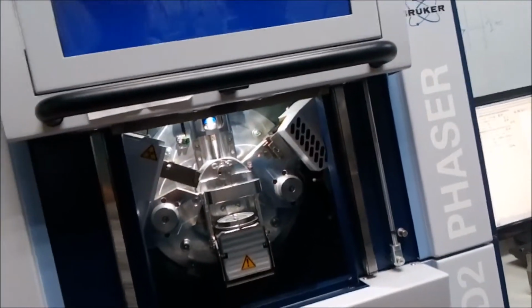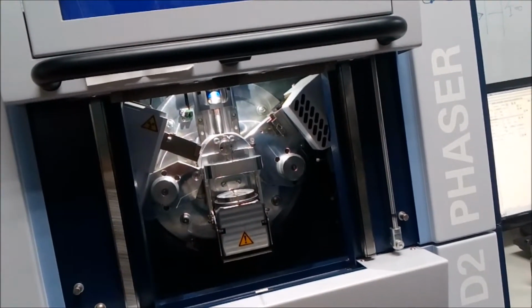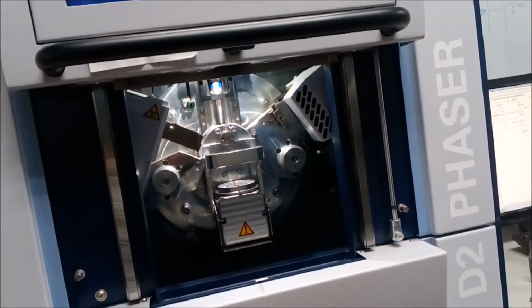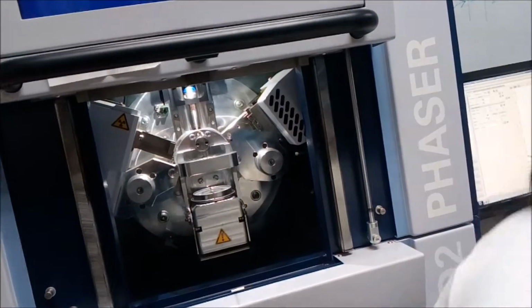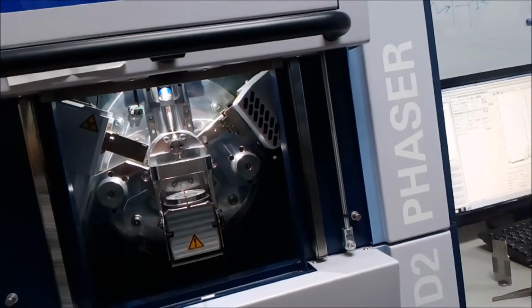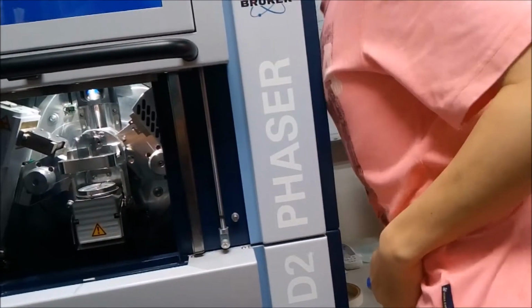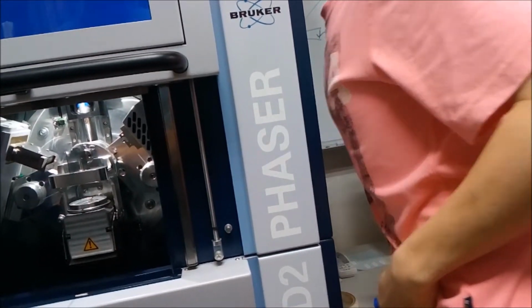Grating. It makes the lines different. Did you know the grating? Don't know that? It's like grit or grating?